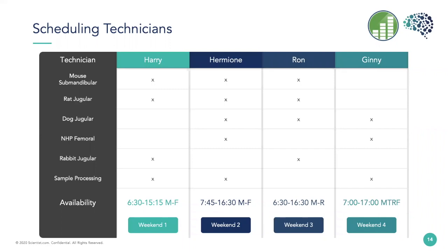So how many studies do you think that these 4 could manage at once? And who would you choose to put on each study to manage it? Would they have to take all of the samples? Would they need to swap? And it gets really complicated, but now if you imagine there are 30 or more technicians that are collecting samples and each one is running 10 to 15 studies at a time, plus night and weekend collections, it's getting really, really hard to manage. So how would you make sure each study has all the sample collections accounted for and processed and stored in time? How would you even keep track of which studies need bloods and when they need them?